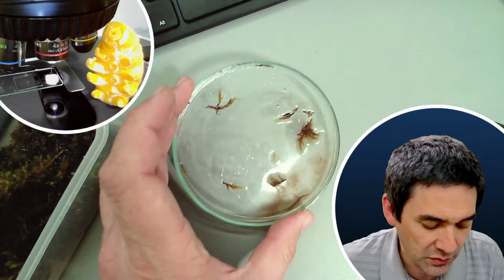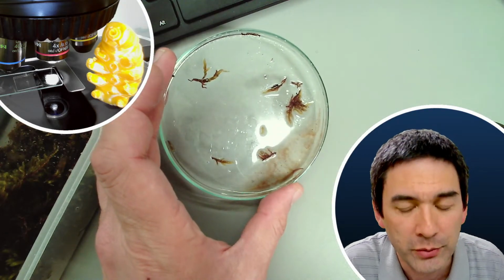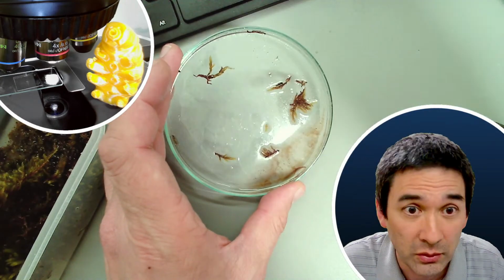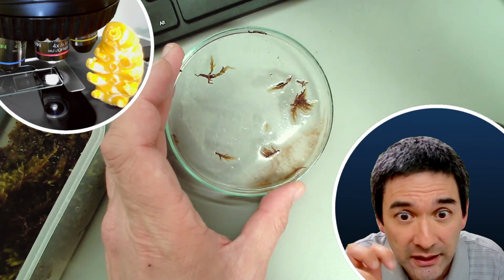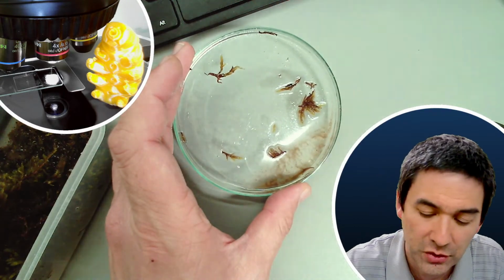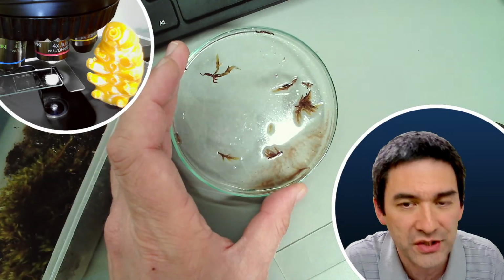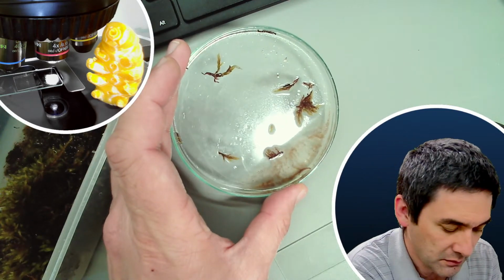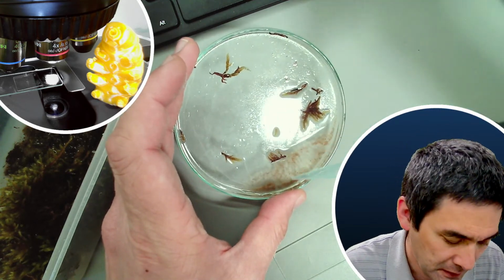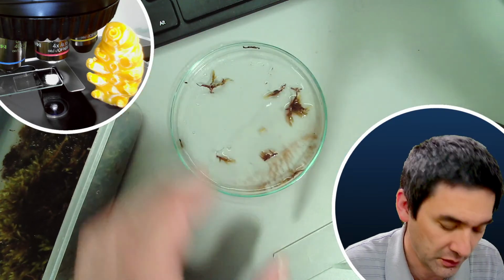And then what I do is I wait a little bit until the solid material starts to collect in the bottom of the petri dish, because many tardigrades like to cling to substances like sediment or leaves. They have tiny claws, and they like to cling to a surface. So it could be that they don't like to come off the moss so easily, and it's a little bit of a question of luck as well. Then I take a pipette and collect a little bit of the solid material here, and I put it on a microscope slide.